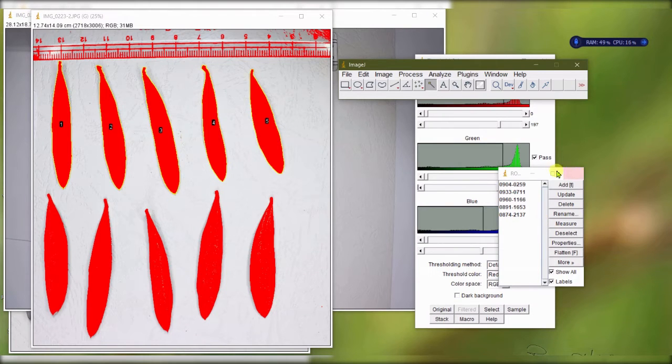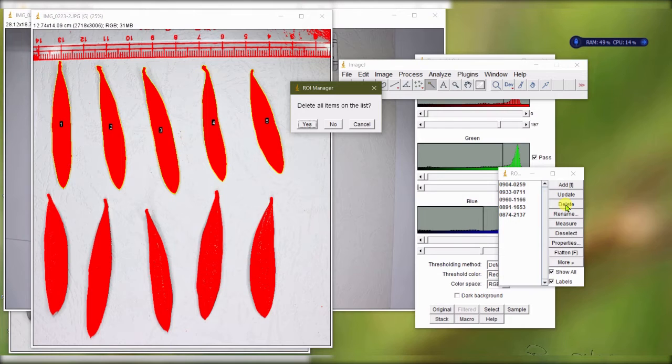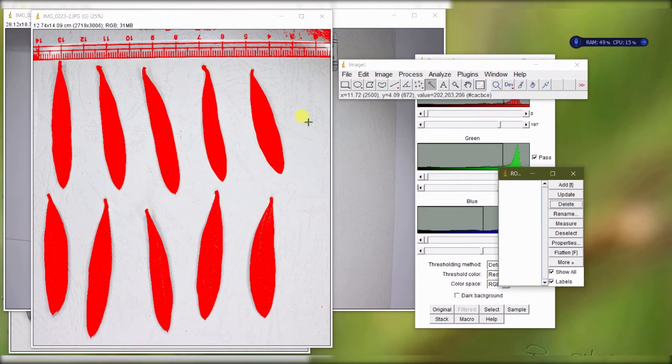Once you are done, you can keep this data and you can also delete the whole thing. Delete it all, and then start from the beginning.